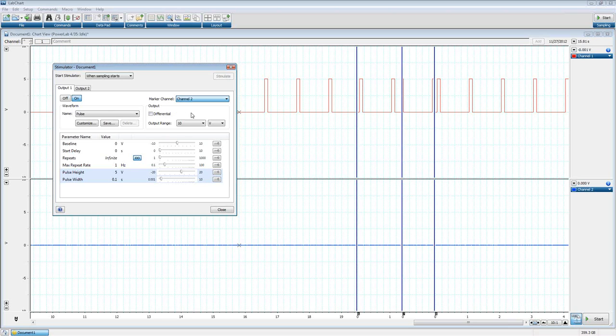But it's a way for you to know that you're stimulating at a certain point without actually piping things back in, like I'm doing here, back into one of the inputs. So normally I don't like putting it over raw data, is what I'm trying to get at. It can affect it, it'll add to it. It's just not a very good idea. You want to have a dedicated channel for that. So I'm setting up channel 2 here as our dedicated channel for that marker.